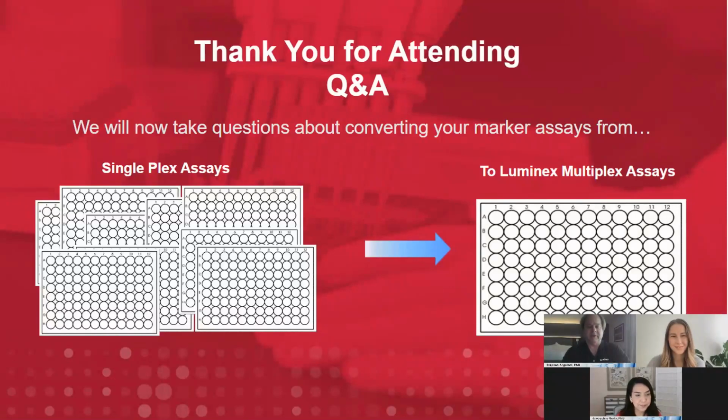Yeah, I can add to that as well, because especially for a lot of the proteomic assays, where you have a cell lysate or something like that for sandwich capture, or if you're doing a serological assay, like we've been doing a lot of these, putting various antigens on a bead. You want to see if there's an antibody titer to a certain pathogen. COVID, a lot of that lately, of course.